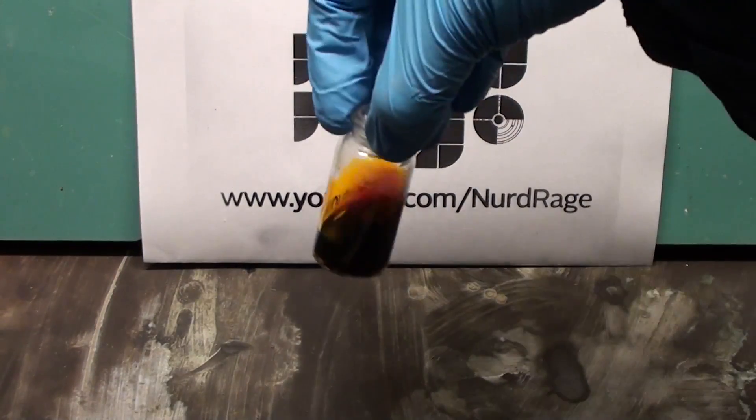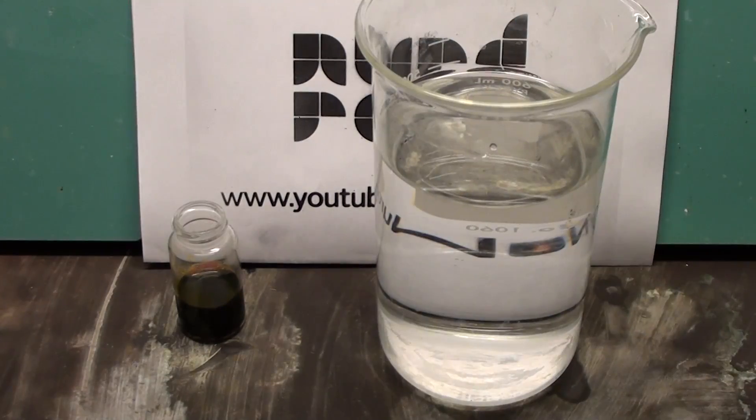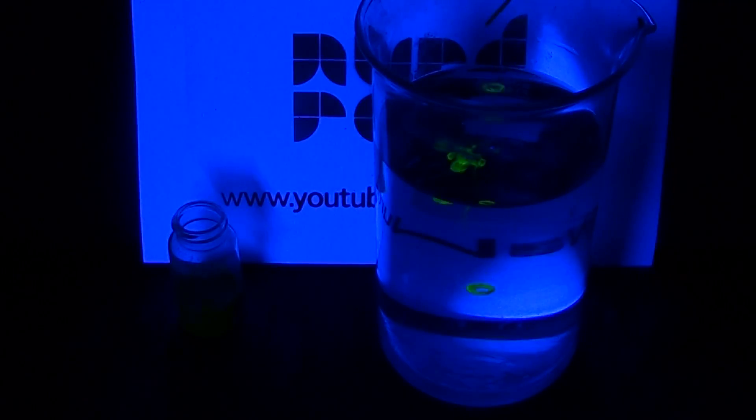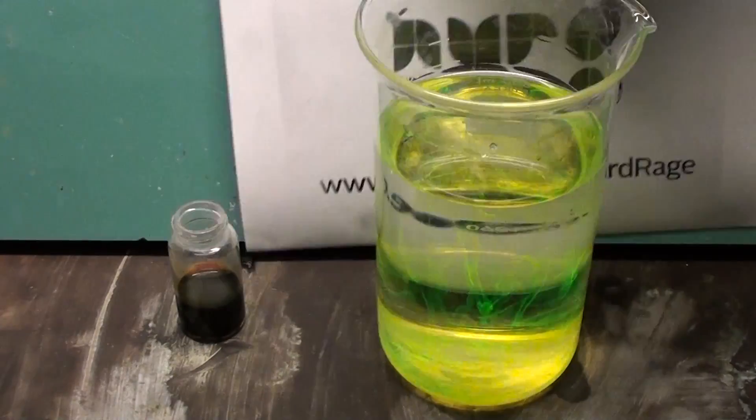Now we have a solution of fluorescein. To test it we put a few drops in water under ultraviolet light. Let's try that again but without the background sign.